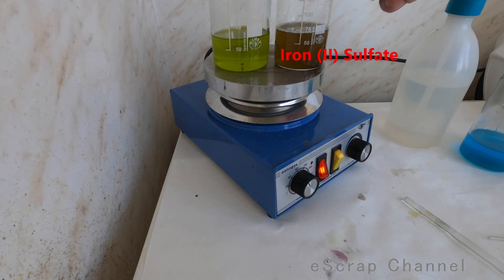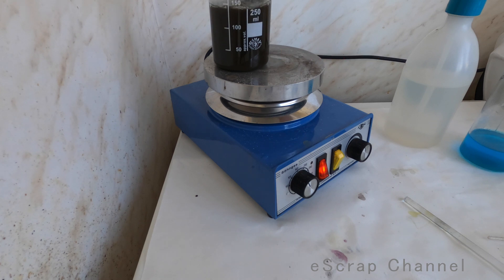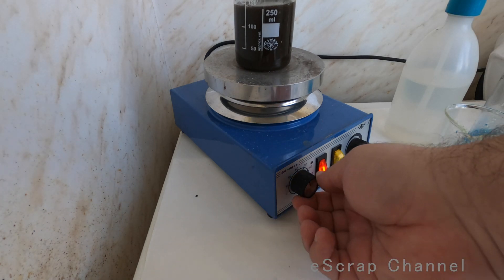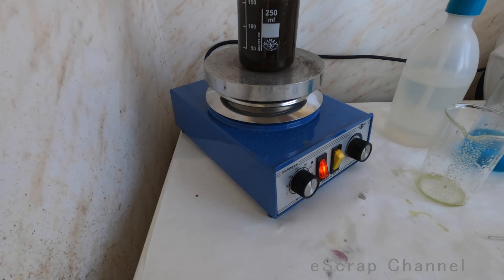Okay so iron 2 sulfate, here it is. Gold here it is, it's time to precipitate it. Gold here we go, here we go that's our gold. Let's boil it now, let's stir a little bit and let's boil it.